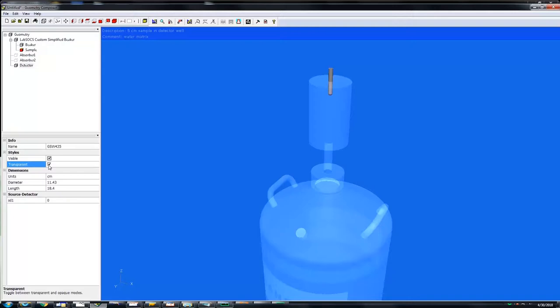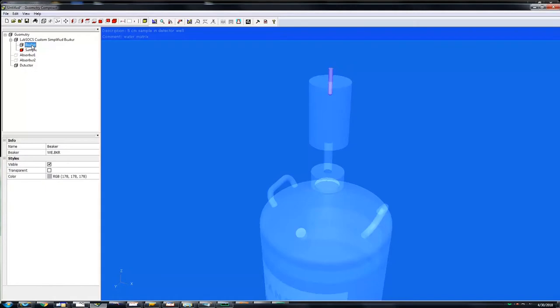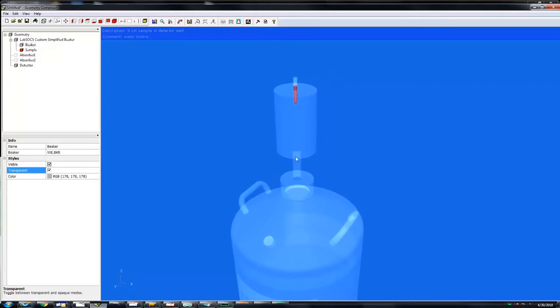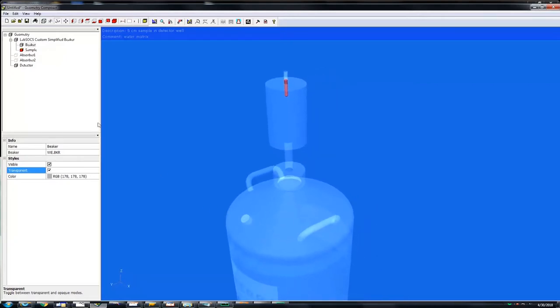To also see the sample within the container, you will do the same as you did for the detector. Click on beaker and check the box next to transparent. The red value inside is the representation of the sample within the container in the detector.